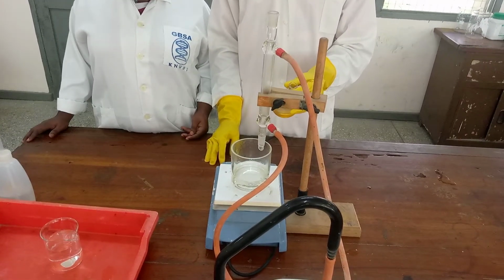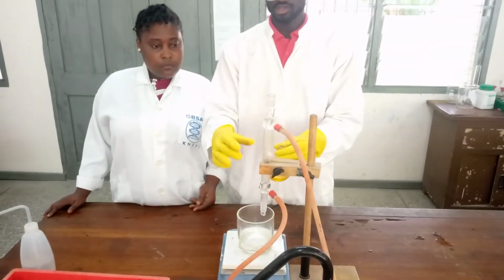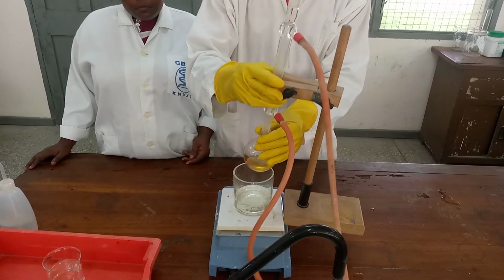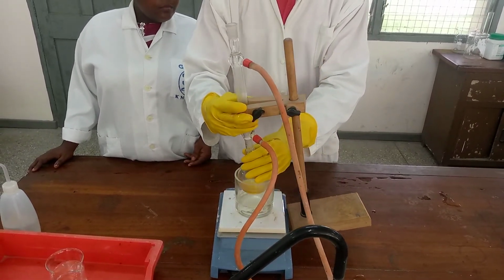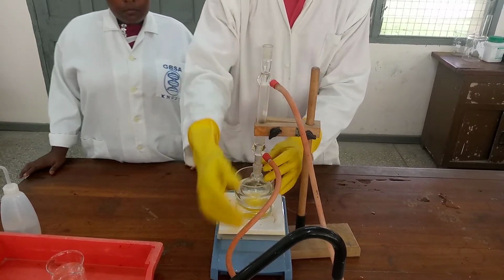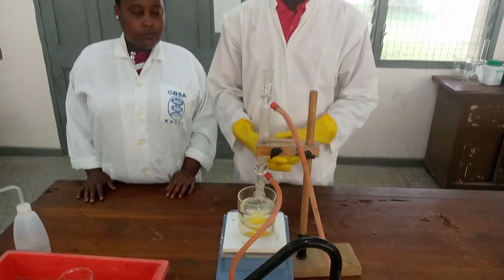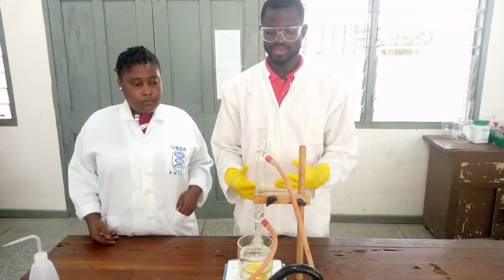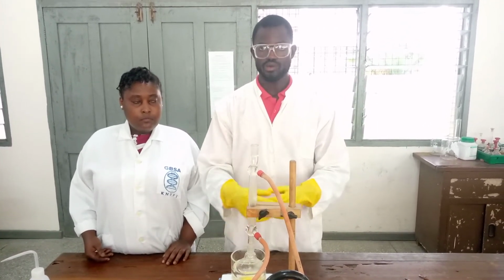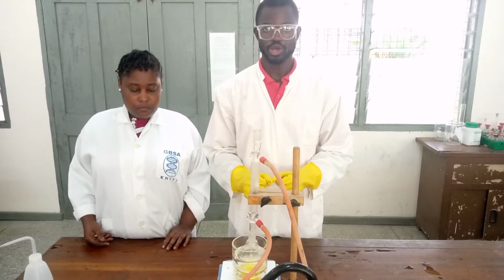Alright, so we are now at our heating plate. We have our condenser, the reflux condenser. So we are mounting it there carefully. We have our inlet and outlet, the reflux condenser in. Then we will heat it for about 7 to 10 minutes. And when the reaction is complete, you see a brownish gas inside our flask. And that is a signal that our reaction is complete.